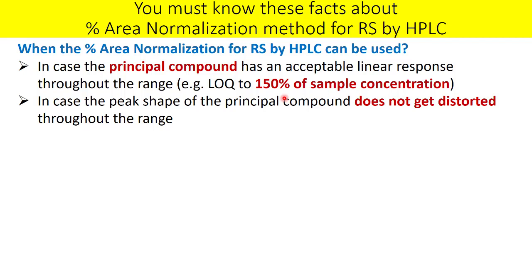Even if linearity is confirmed to 600 ppm, at higher concentrations the peak shape can get distorted — it may plateau, flatten at the apex, or produce an M-shaped peak. At 100% of the sample concentration (400 ppm) the peak shape may be fine, but you must also confirm the peak shape is acceptable at 150% (600 ppm). If tailing is below your system suitability criteria, percent area normalization can be used.